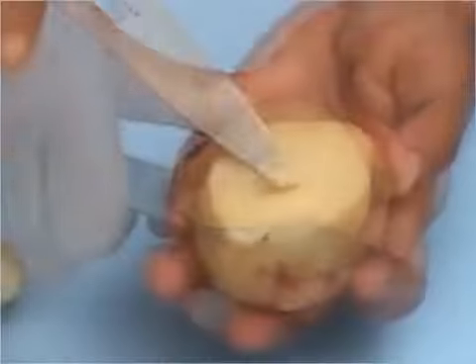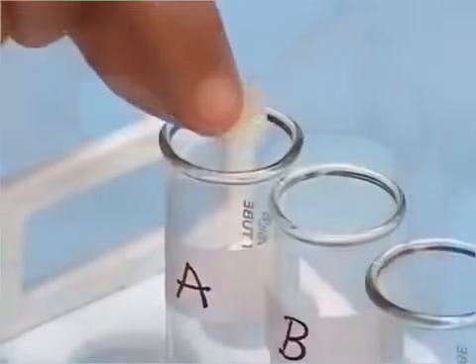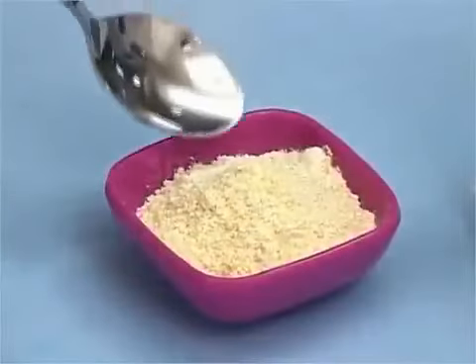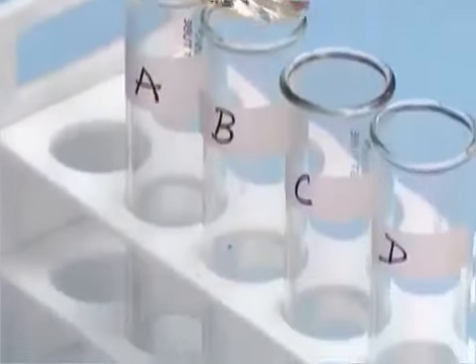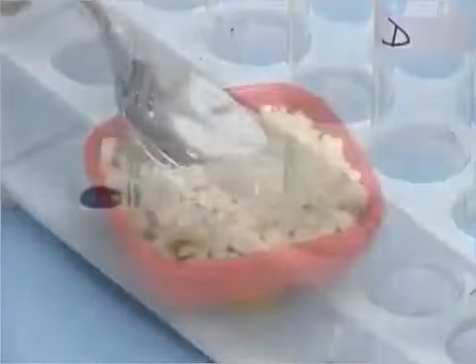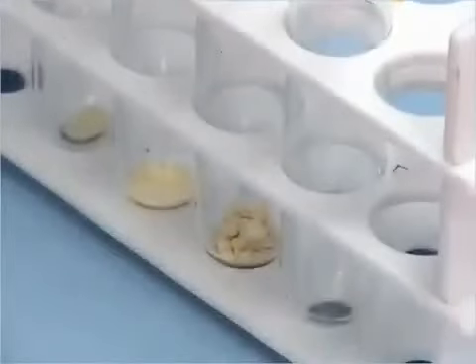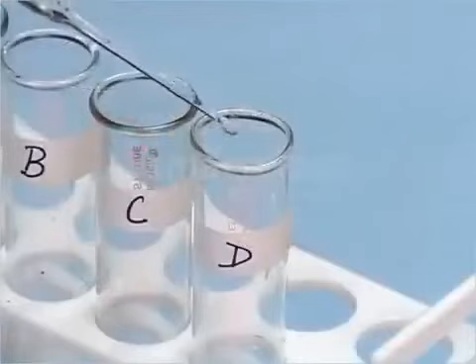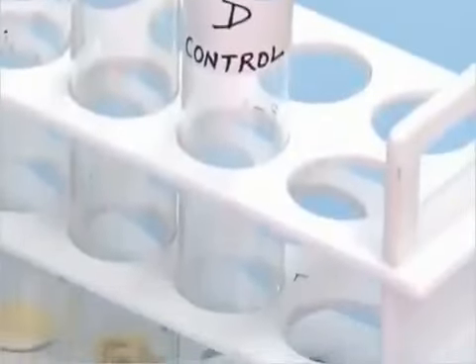Now, similar to the first experiment, put a piece of potato in test tube A, a little quantity of powdered pulse in the test tube B, and a few pieces of crushed cashew nuts in test tube C. In the test tube D, add a little amount of water and label this as control.